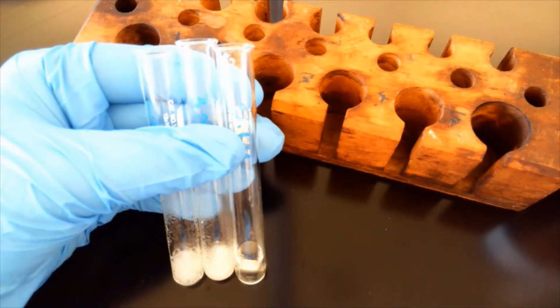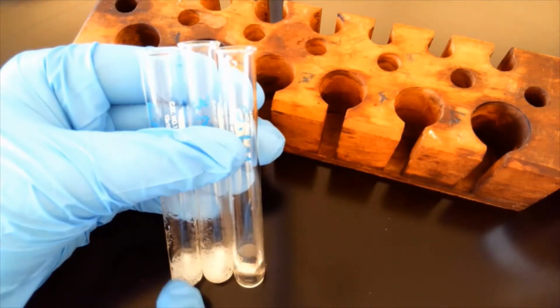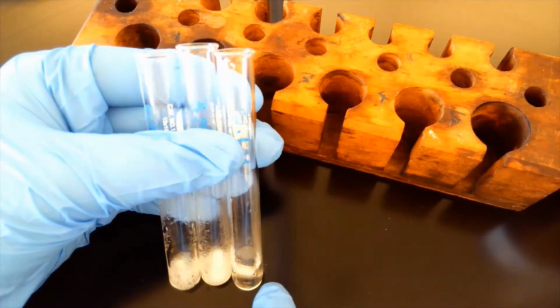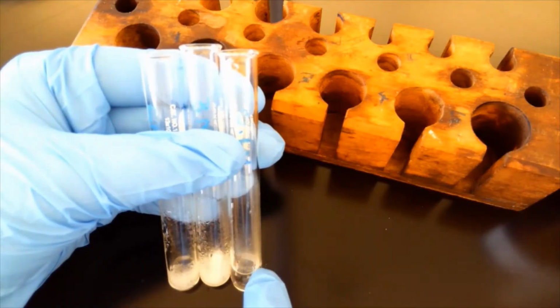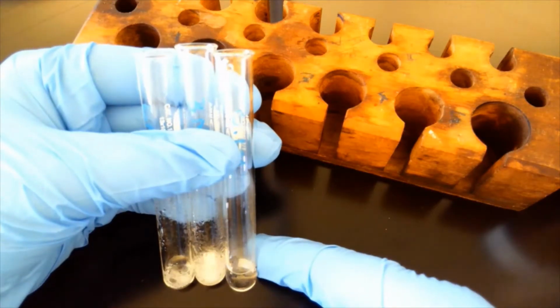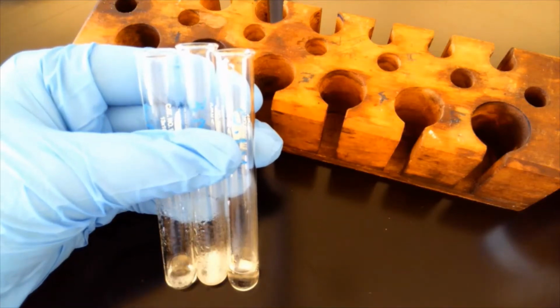So the strength of the acid does matter. The stronger the acid, the hotter it gets, and the faster it reacts with the metal, the more vigorous the gas formation and the bubbles you see. The less strong it is, and the lower the molarity, the less of the reaction you're seeing, and it's taking longer. So this is quite cool to the touch, very limited bubbles, versus very hot, and now the metal is almost gone here.